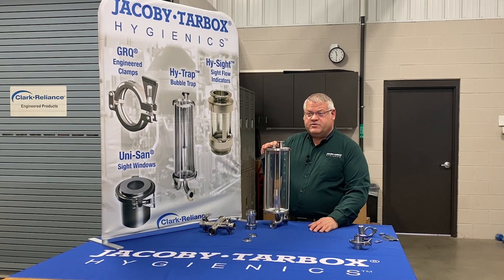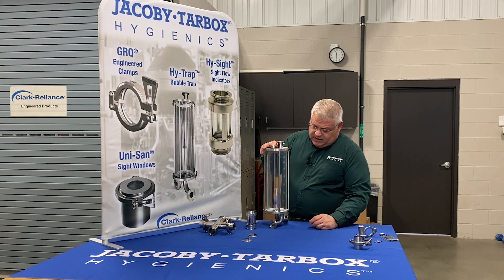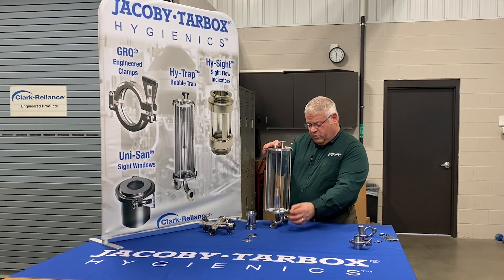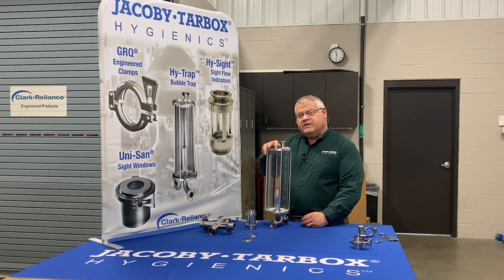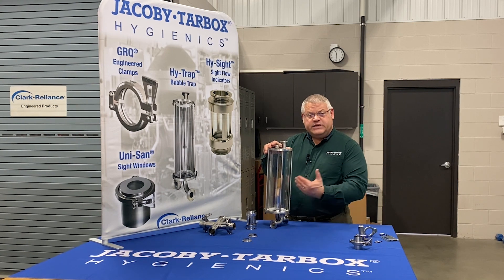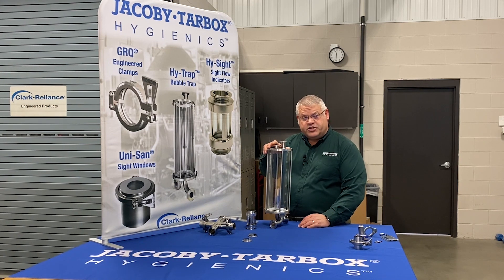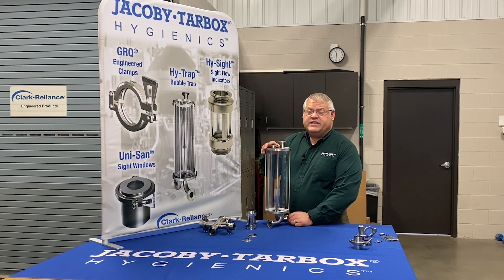Taking from the bottom of vessels, where you have multiple tapers to create a more efficient drain, we've incorporated an in and outward angle intersecting so we easily drain the bottom of the bubble trap. This was done because the Hi-Trap has a centralized input, meaning that liquid is equidistant from the wall in all areas. This allows for more efficient and accelerated bubble dispersion inside the bubble trap, potentially decreasing residence time.